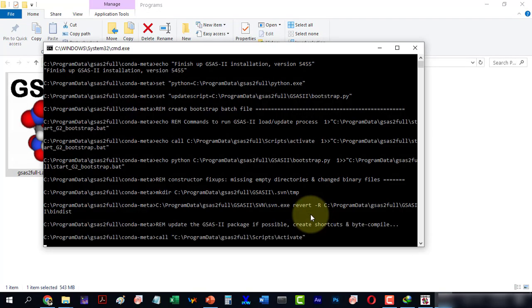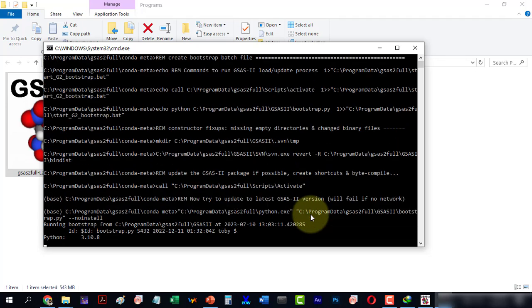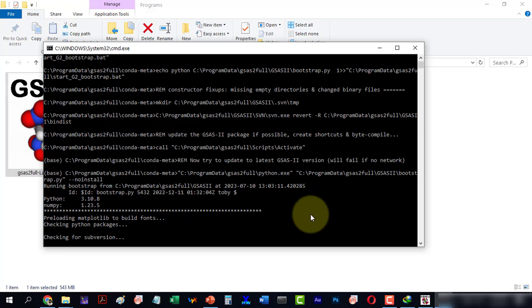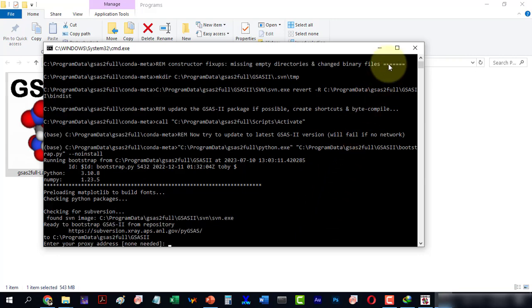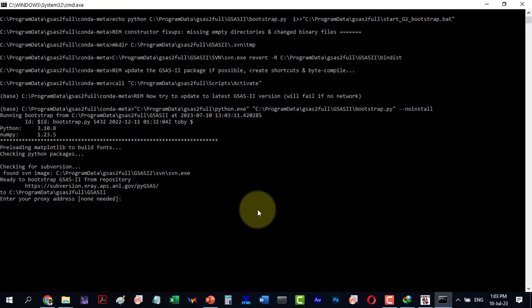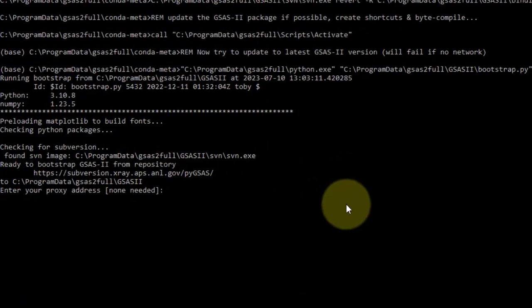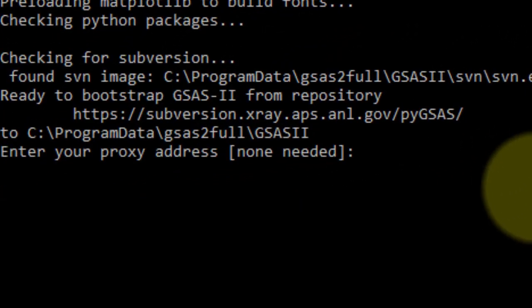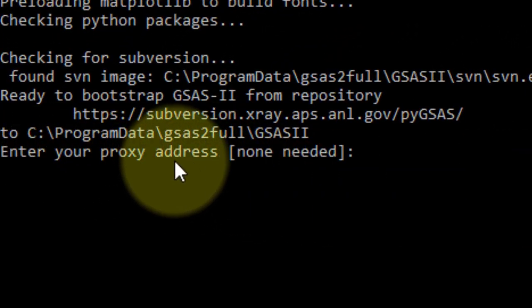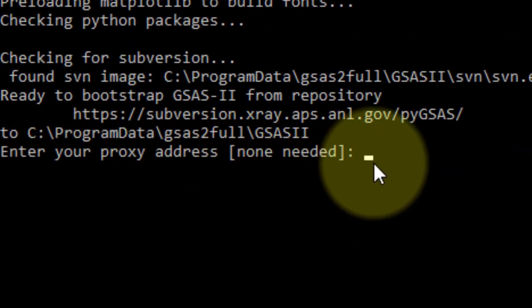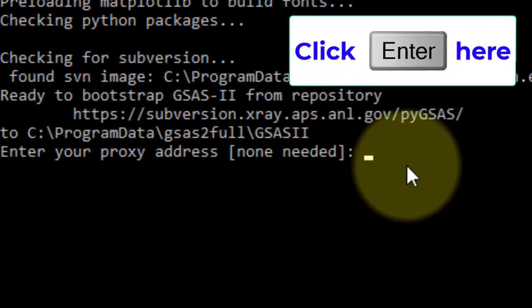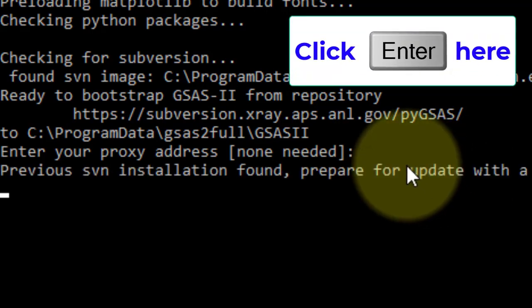This is the base window which shows all the installations. Here is a crucial step where it stops and asks for your proxy address. Simply press enter without entering anything.